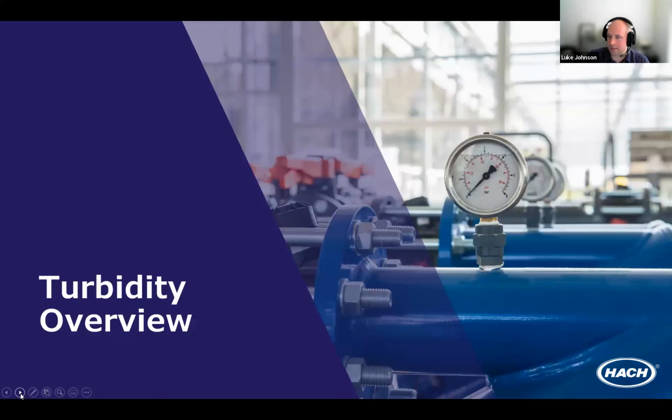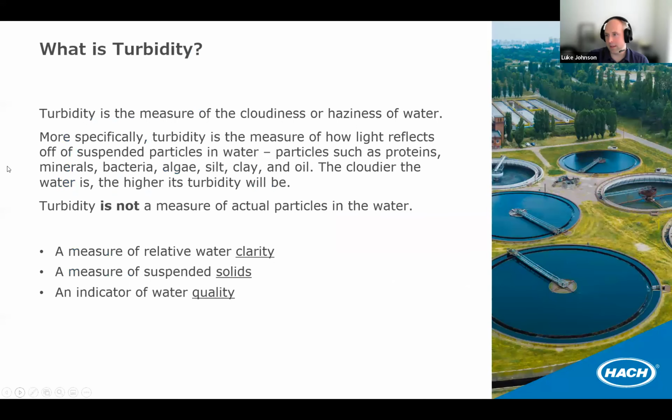All right, let's talk about turbidity. First of all, it's good to know what turbidity is. Turbidity is the measurement of cloudiness or haziness in water. If you've ever seen your drinking water, hopefully you can see right through it. That's clear, that's a low turbidity.